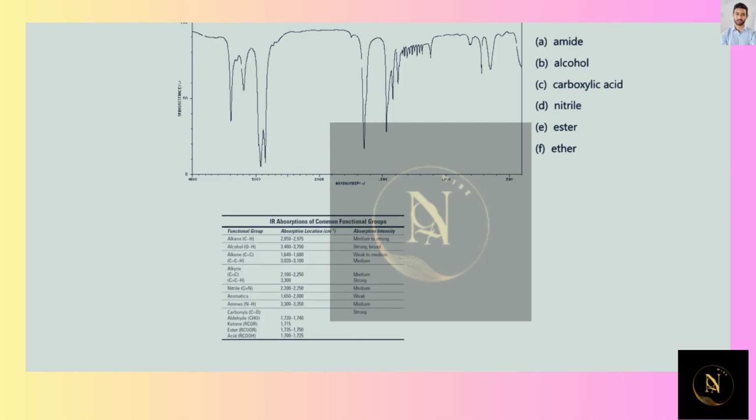We want to identify the functional group that is going to appear on the following spectrum, and the first thing that we need to identify are the different signals that we have. So first of all, let's look at this signal that is appearing at around 1600, 1700 to be more precise, cm^-1. This is going to be very strong. This is a strong signal. It is not broad at all. It is quite defined. So this is going to be characteristic of a carbonyl group.